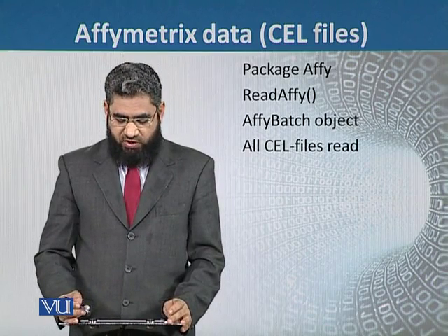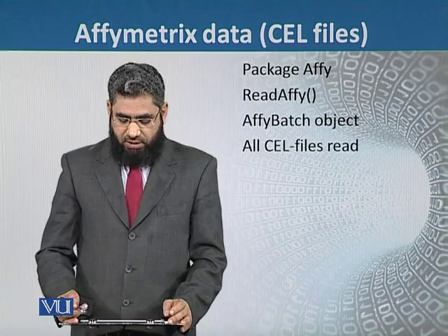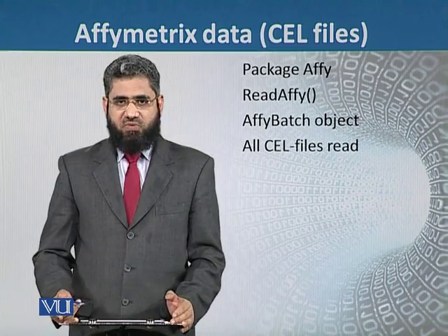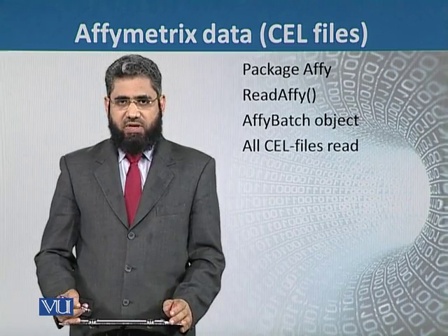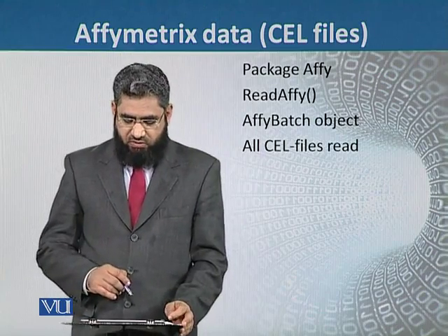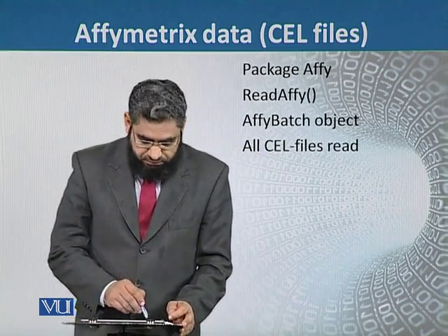And if we want to apply this command to specific CEL files, then we have to specify which files we want to apply the ReadAffy command to.